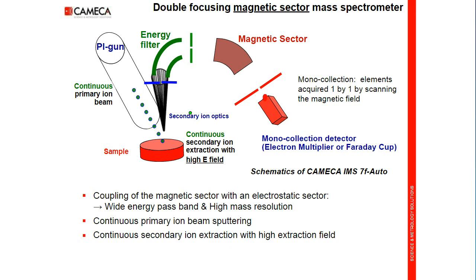The DC mode, combined with a strong extraction field for the secondary ion collection, allows to optimize the instrumental transmission and thus to achieve low detection limits. In order to enhance the ionization yield, dynamic SIMS uses reactive primary ions, oxygen or cesium, of energy range between 100 eV and a few tens of keV.